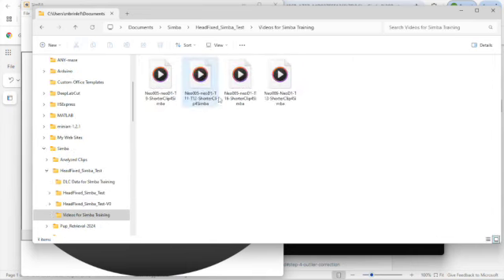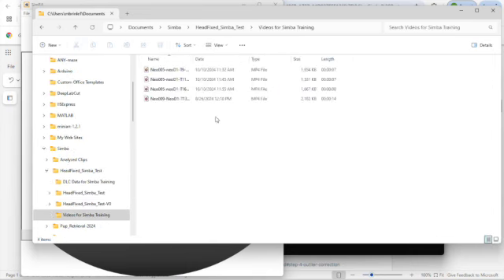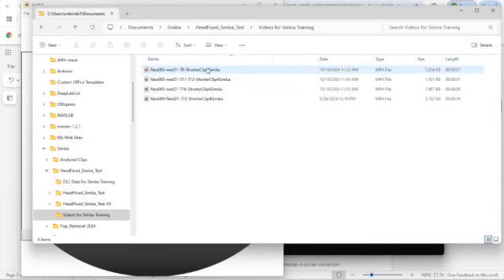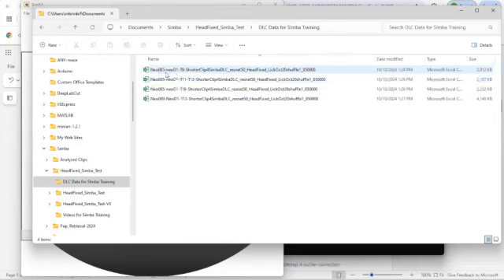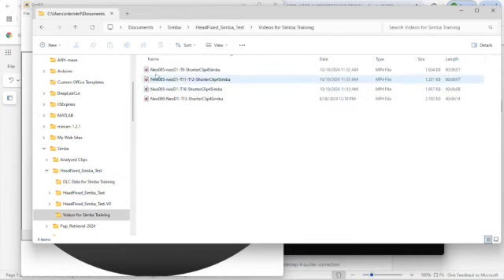And then I also have all the corresponding videos that I had put through DeepLabCut to get that data. And these video names have not been changed since this DeepLabCut data was created. So the beginning of this DeepLabCut data has the exact same naming configuration as my videos, and that's important for SimBA as well.